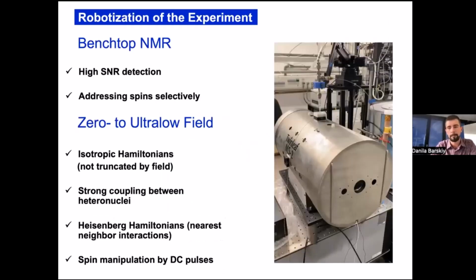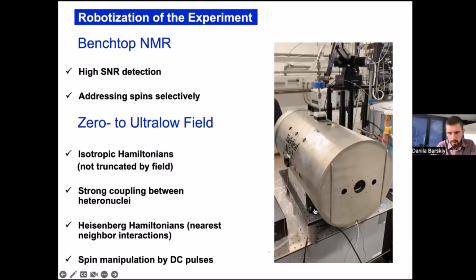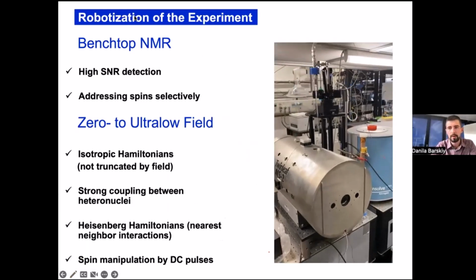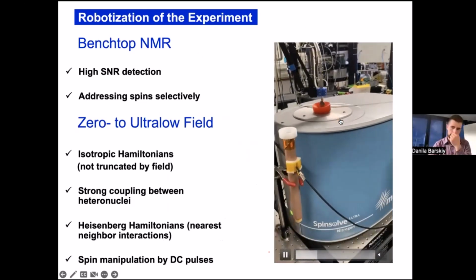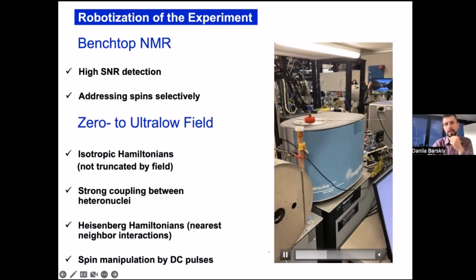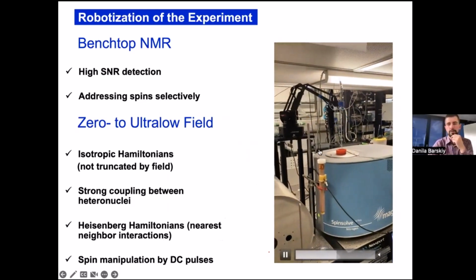And this is a more advanced kind of setup that we have in our lab. So we have, let me see if I can show the video. So we have a robotized setup which allows transferring our sample with all the tubing for parahydrogen supply. It's actually under some elevated pressure, about 3 to 5 bars. We can transfer parahydrogen and really automate acquisition of our spectra.